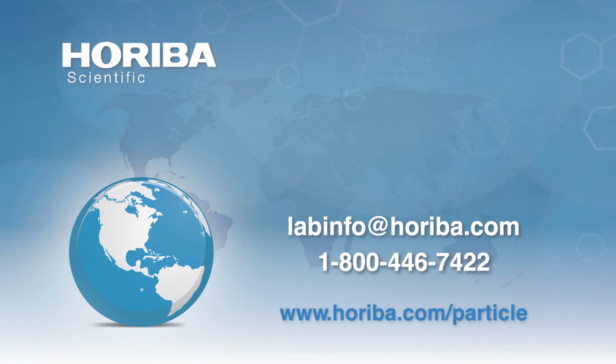Okay, the next question is, what's more important, determining the number of particles or the volume distributions when it comes to dry particles? Well, in a lot of cases you really want to know both, because as you're using the materials, you're going to want to use so many milliliters of such and such a concentration. So in certain cases, the count would be important. In certain cases, you just want to know the distribution and you don't care about the total number of particles. Some techniques measure one, other techniques measure the other, and it's really going to depend upon what you're going to do with the data, which one would be more valuable to you.